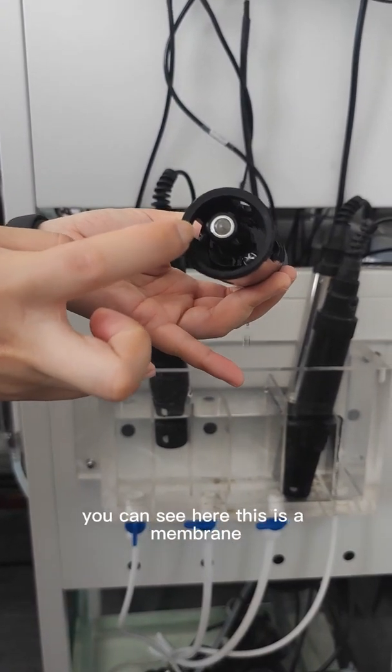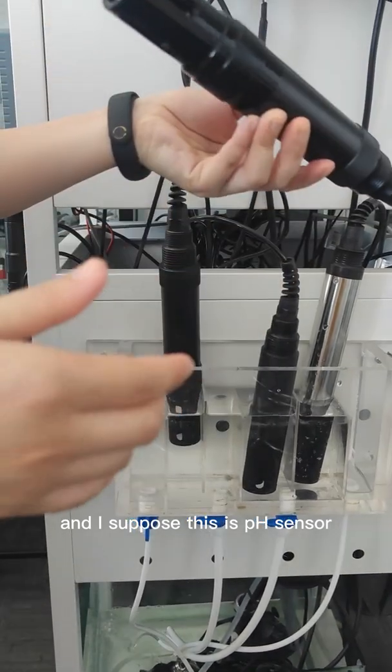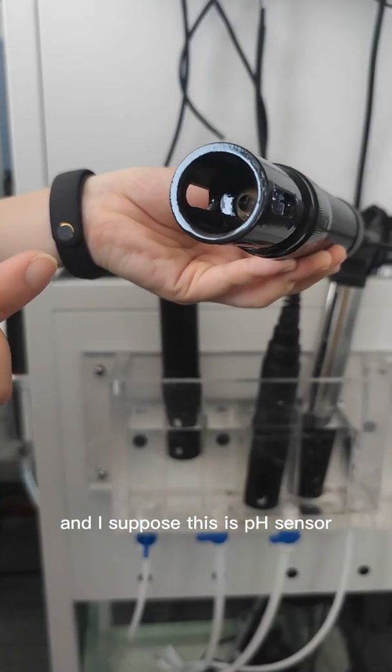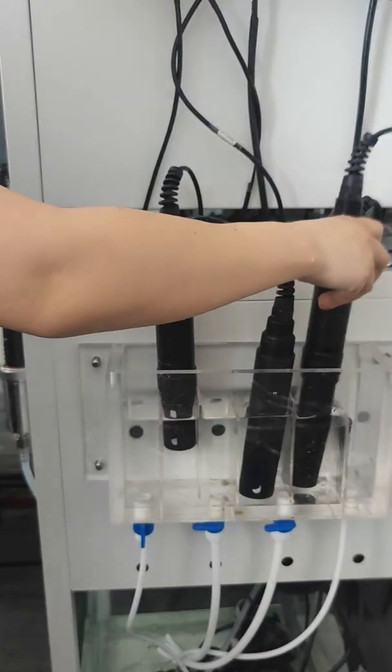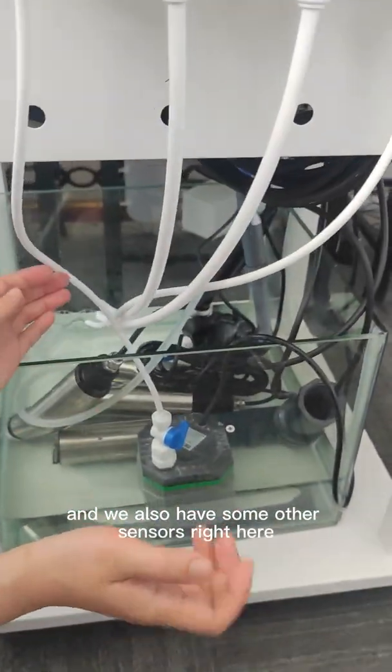You can see here this is a membrane, and this is a pH sensor. We also have some other sensors right here.